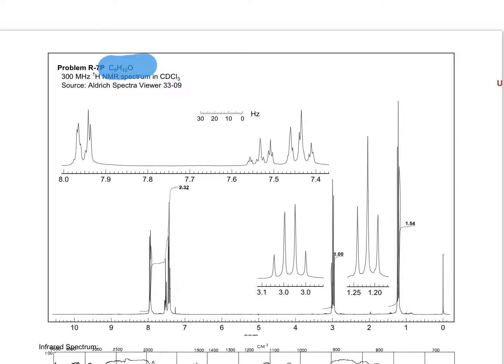Sometimes you will see those S-shaped lines. If the number is not given, you can estimate the height between this point and that point, and then between that point and that point, and the ratio is about, in my eyes, 2 to 3, and it happens to be the same ratio over here.